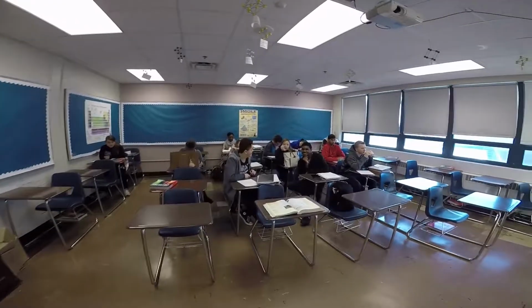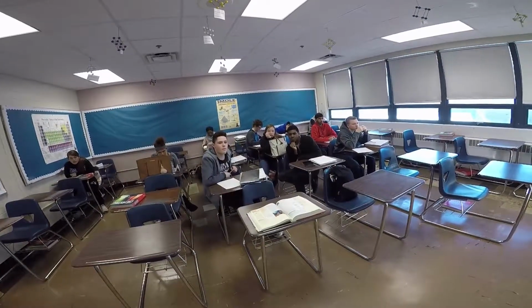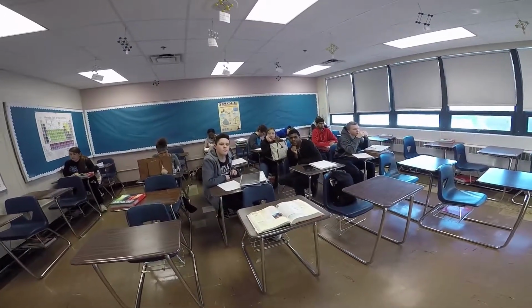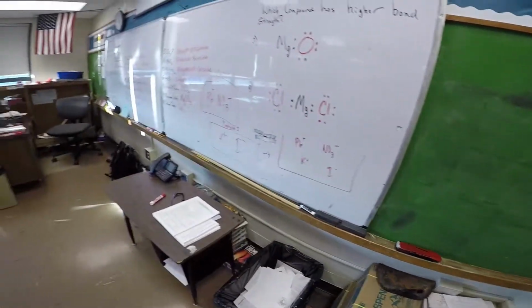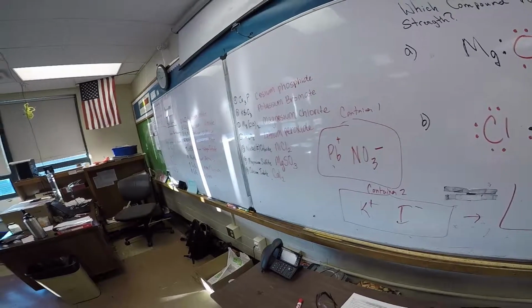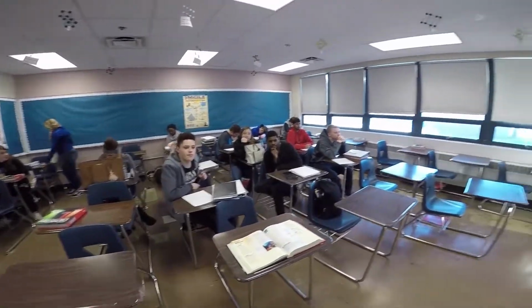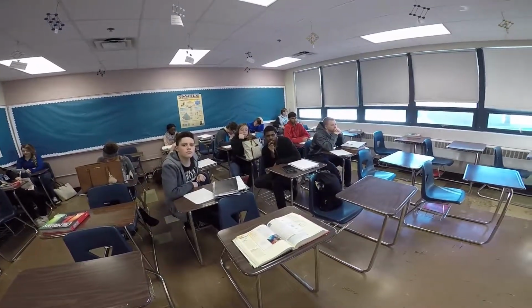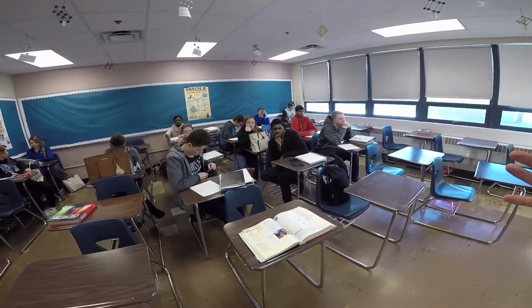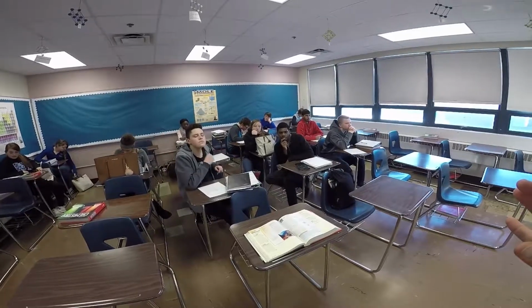It's a solid substance. A solid substance is going to form at the bottom of the well plate. And you're looking for the well plate that has the greatest amount of the precipitate form, because that's going to show you what the formula is. That means you're going to have the least amount of waste. So these are all one charge. Does everybody see that? So you're looking for the well plate that has the greatest amount of precipitate, and that's going to tell you what the ratio is. Does everybody know how you can predict here what your two possibilities are? And then you're just trying to see if that's true. Does anybody not understand that? Raise your hand if you don't.